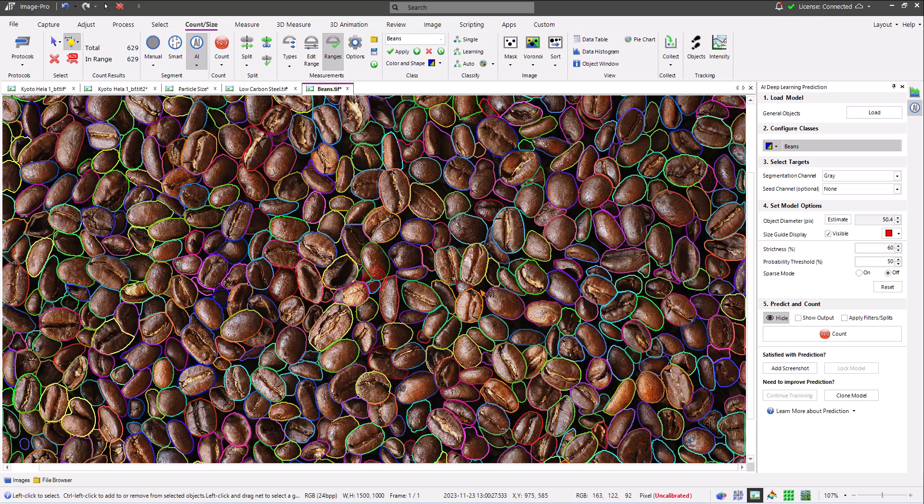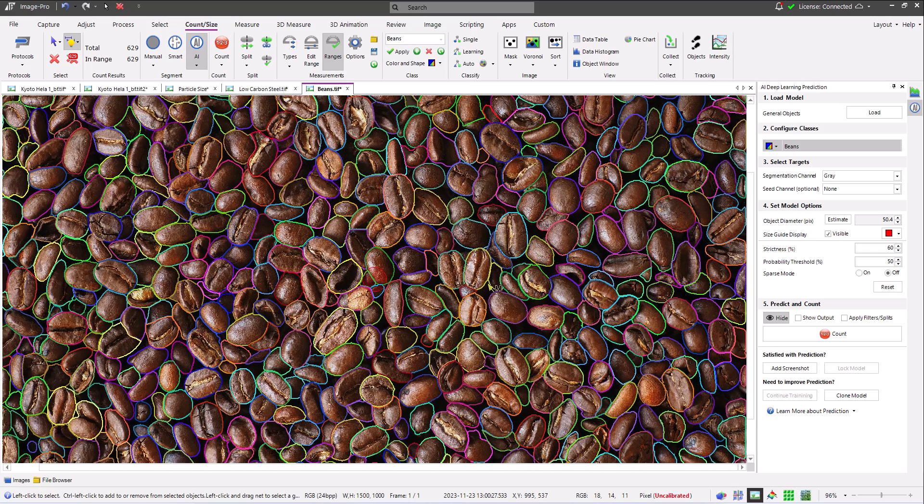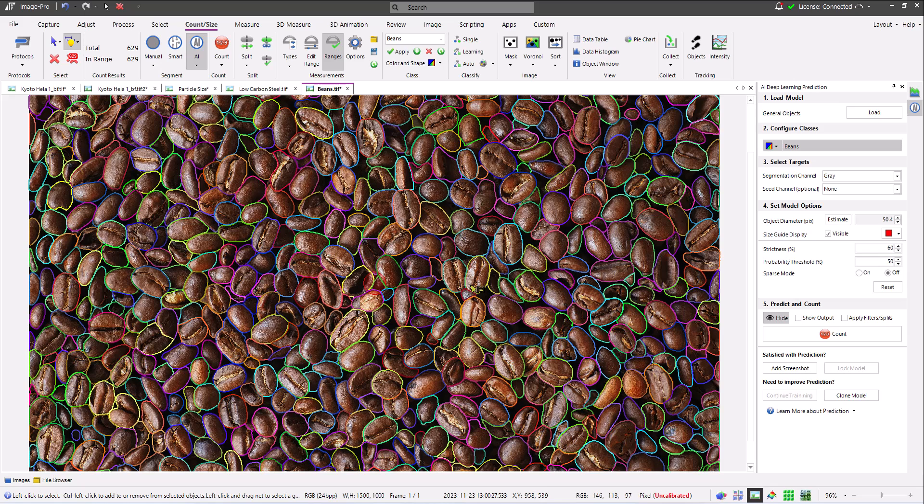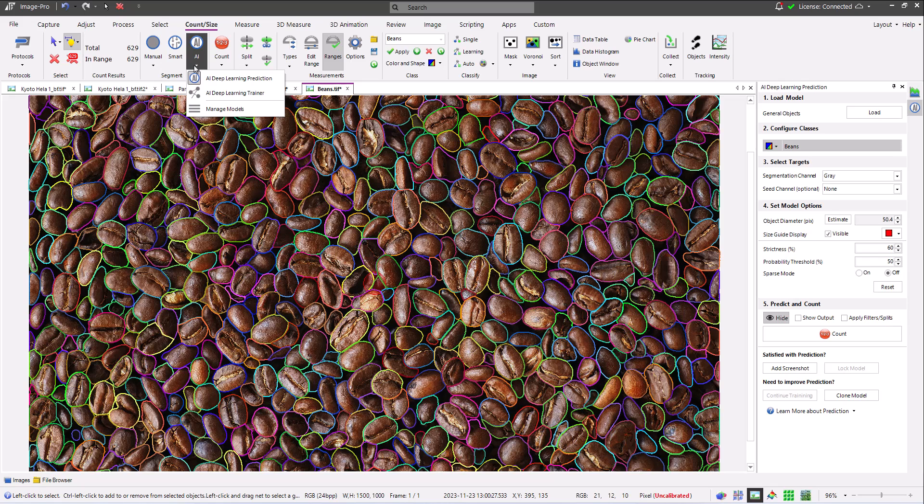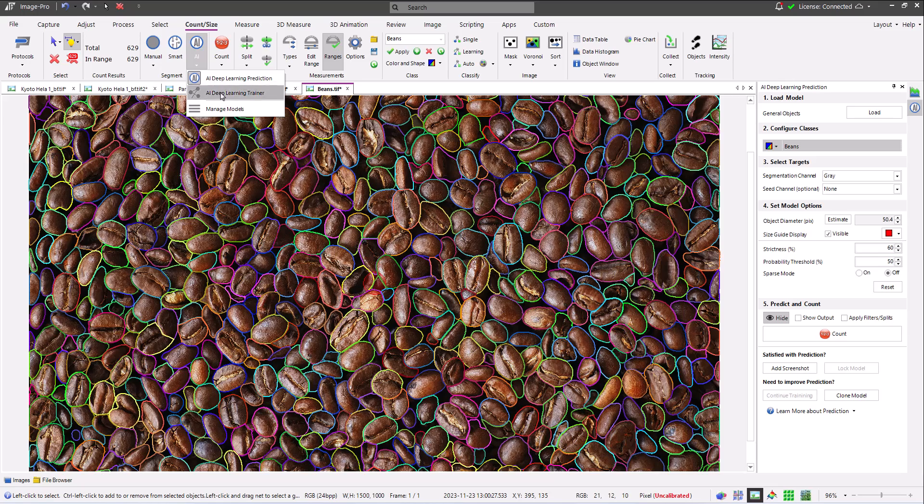Now I'd like to return to the AI button in the segmentation tools on the count size ribbon. By using the drop down option at the bottom of the button, I can access further deep learning options. Here I'm clicking on the deep learning trainer.